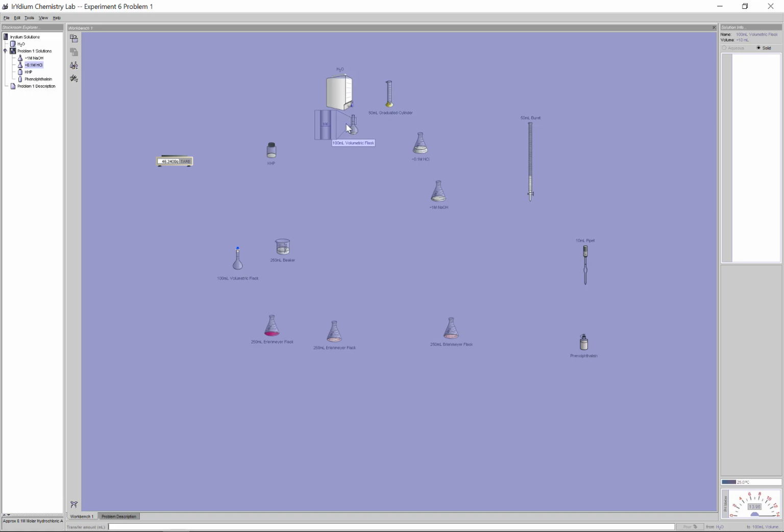I only have 8. Let me pour in maybe 80 pretty safely. Right now it very quickly fills up here. Now I have about 88. So maybe I'm going to fill it in another 5. You can see this line here getting closer. Maybe transfer in only 1 ml at a time here. As it gets really close to the mark, I might want to switch over to using a dropper so I can start adding in maybe half drops, 0.5 at a time. I just don't want to overdo it here. Maybe drop in 0.2 if I can here. I want to make sure the bottom of the meniscus is at that mark there. So there we go. We've made a solution here. This is now my diluted NaOH solution.